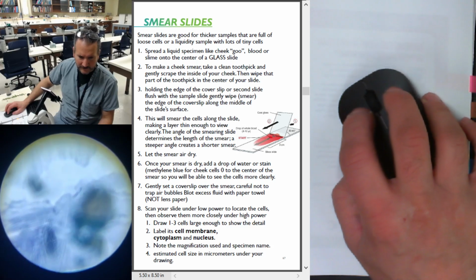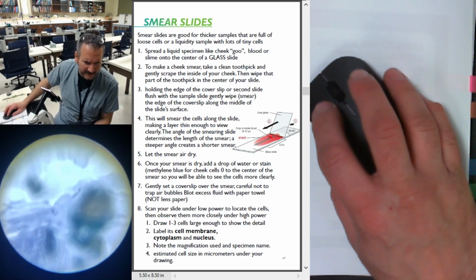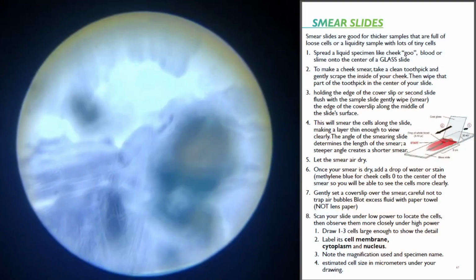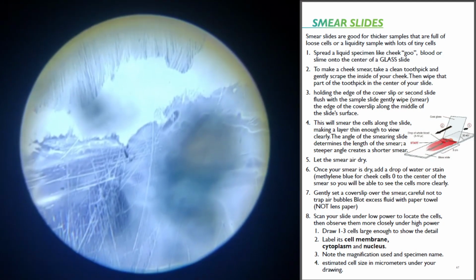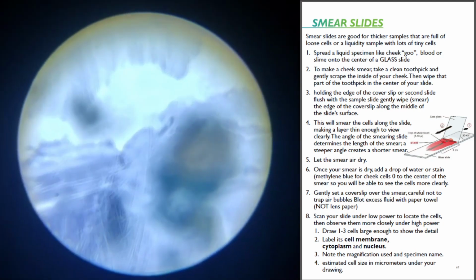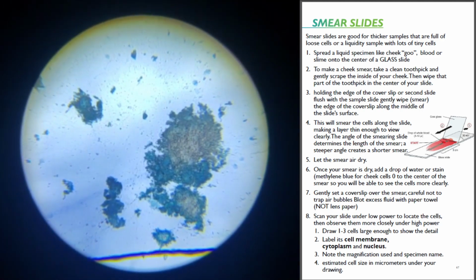There we go. Let's see. Get a closer look at it. The camera's still trying to auto zoom in and out. Alright, that scratches. There we go.